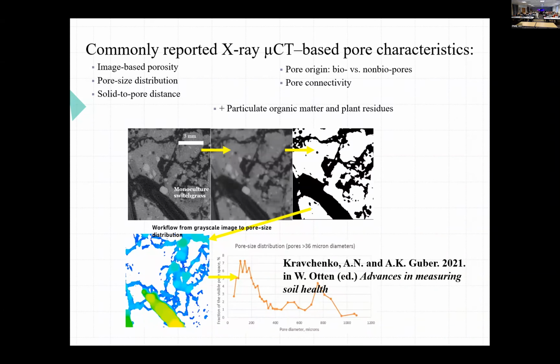But each step involves a very long list of settings and parameters, and they will not be the same for every scanning setting. They might not be the same for every soil. They might be different for soils of different textures, soils of different mineralogies, and even for soils of the same texture and same mineralogy, but with different vegetation or management history.